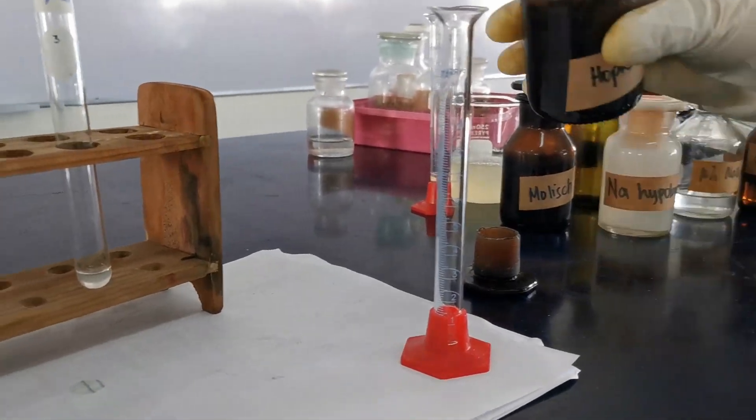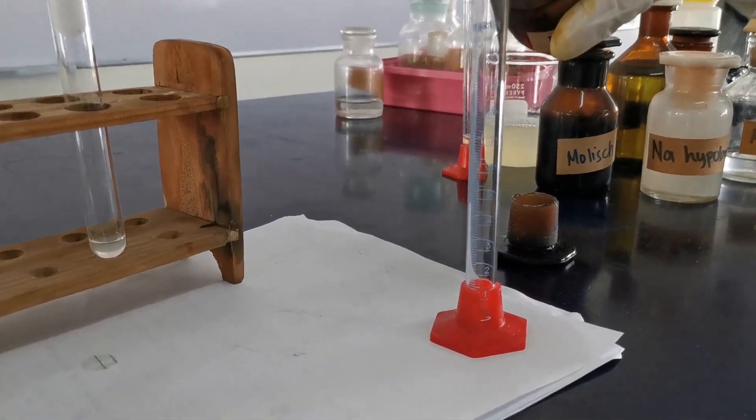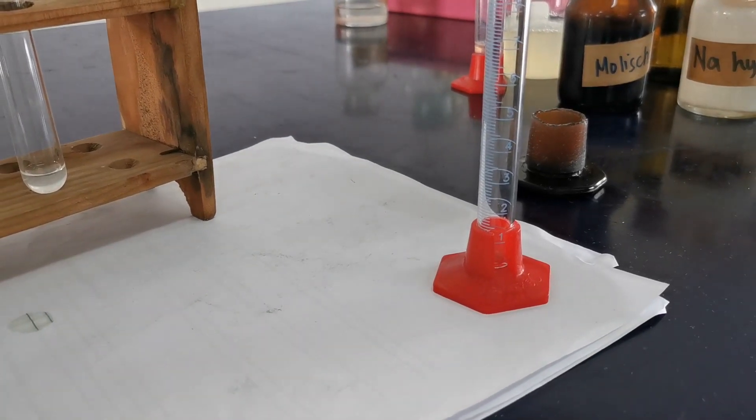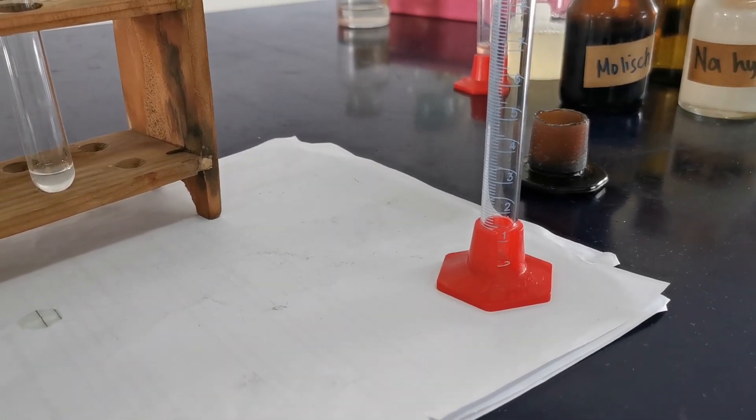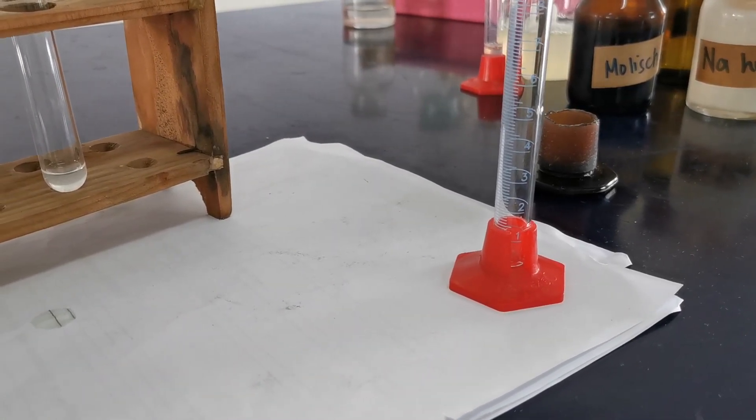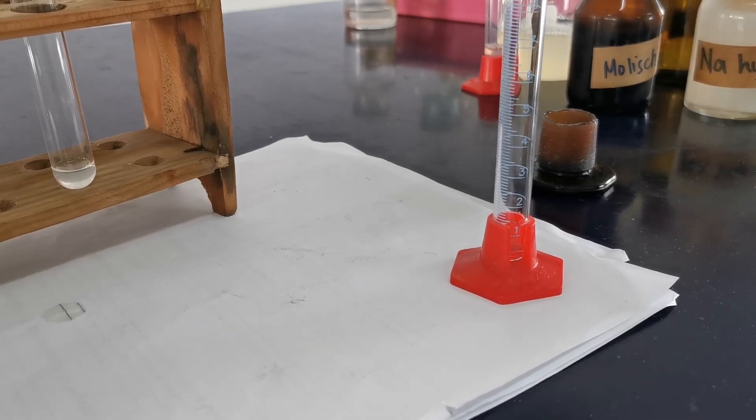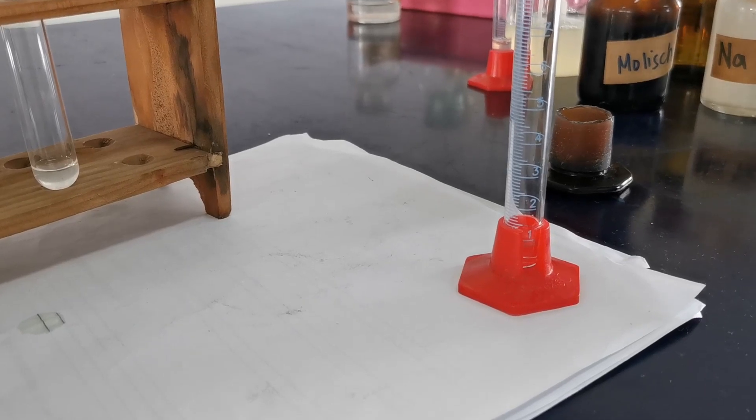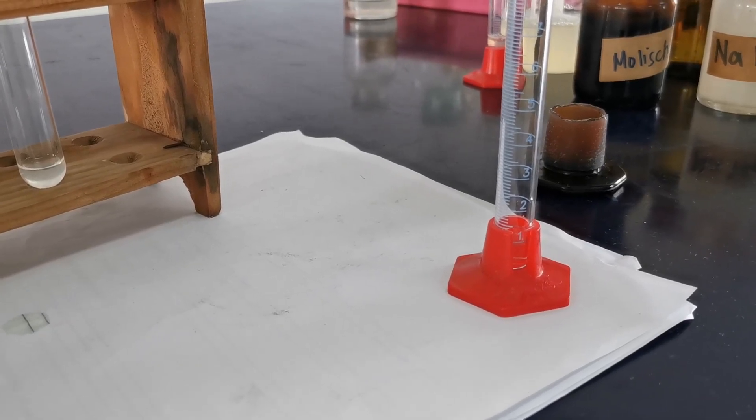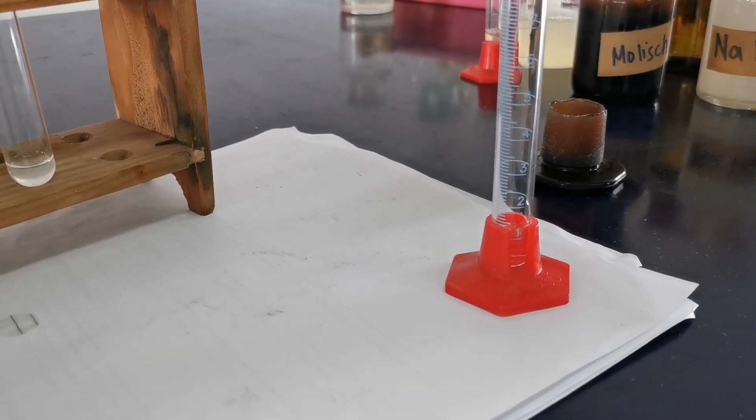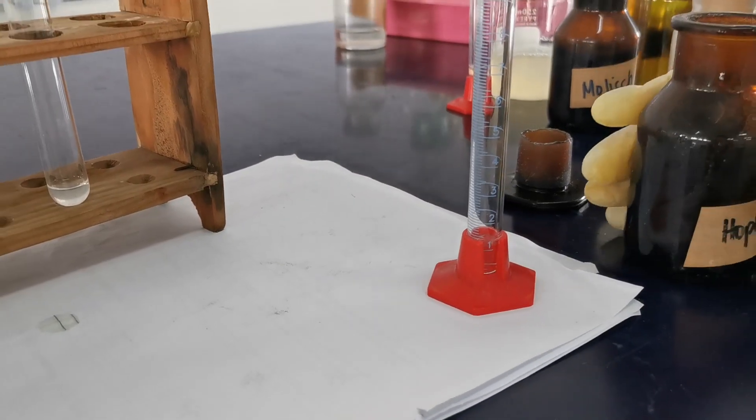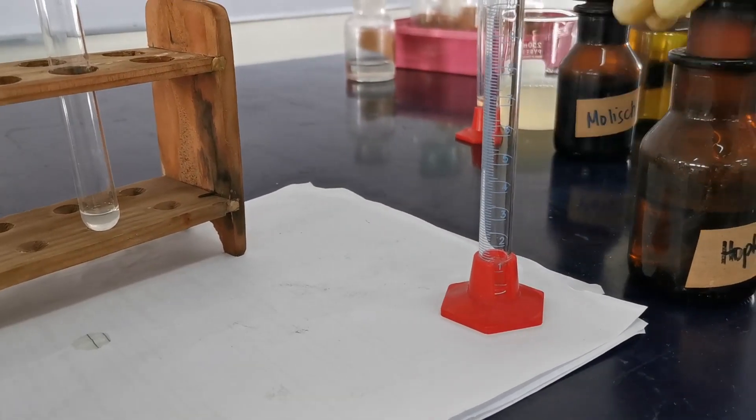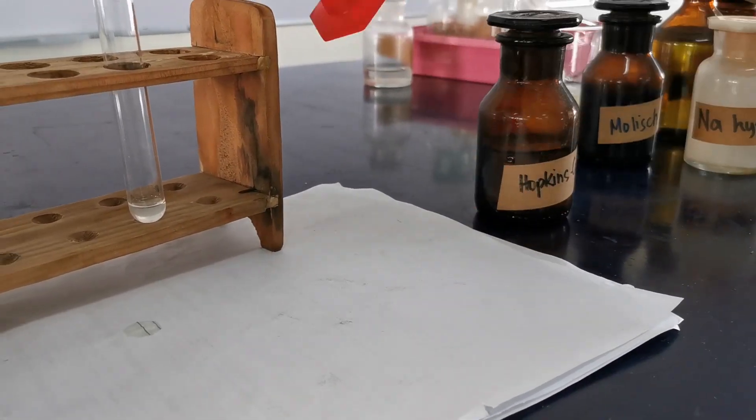Using the graduated cylinder, get 1 ml of egg albumin solution and 1 ml of Hopkins Cole reagent. Mix the two solutions.